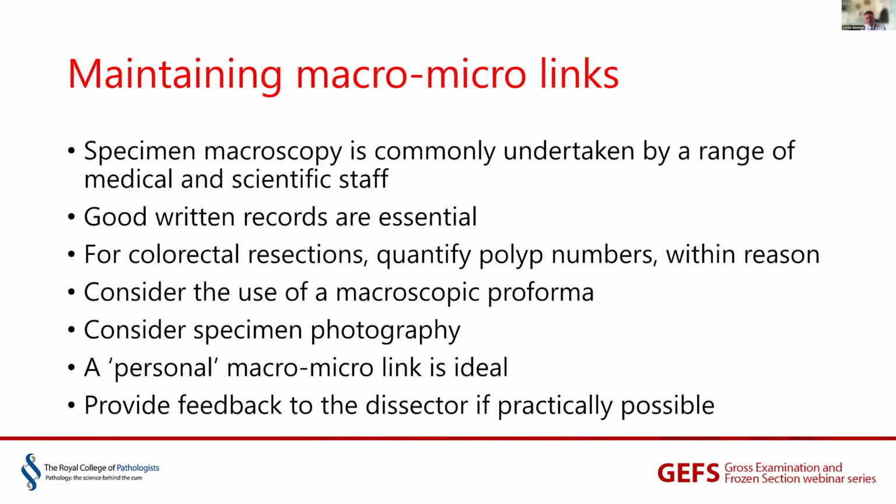Yes, we use a macroscopic proforma in Southampton to help to organise our macroscopic description, and you can certainly do that even if you use a proforma. You can include a comment section if you need to. And we don't photograph every single case, but you should certainly consider it, particularly for things like the more complex procedures, maybe the extralevator abdomino-perineal excisions, or the pelvic exenteration specimens. Sometimes the surgeons find those very useful. They can often relate them to the CT scan.